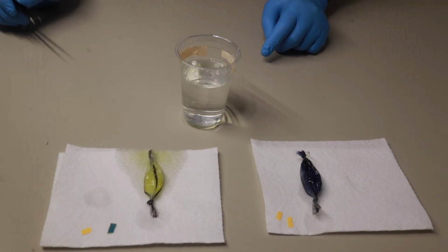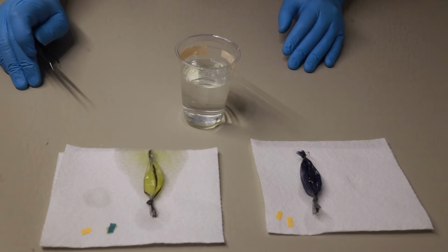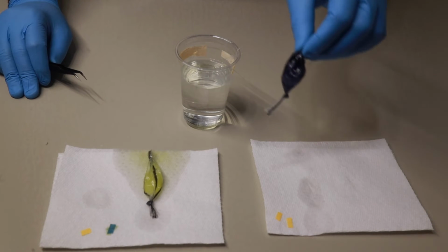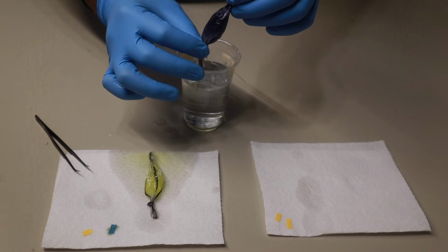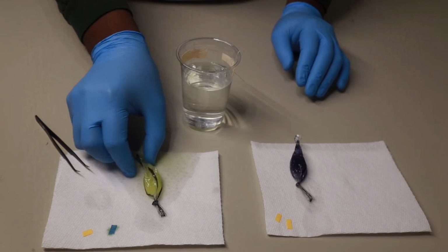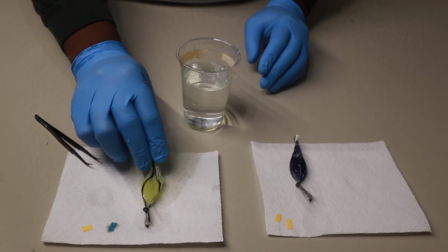Was glucose there to begin with? Think about it. We added water and starch indicator. So there should not have been any glucose in the solution originally. And now we also see that for our cell contents that had starch, glucose, and water, we now see there's a blue color. So what reacted to give us this blue color? In our test solution, we don't see any reaction.